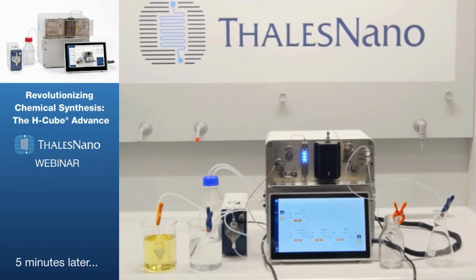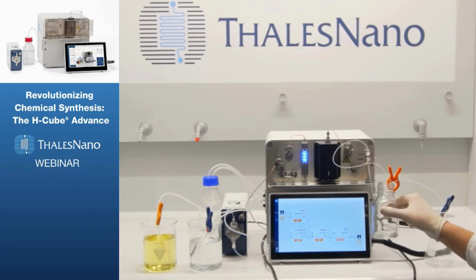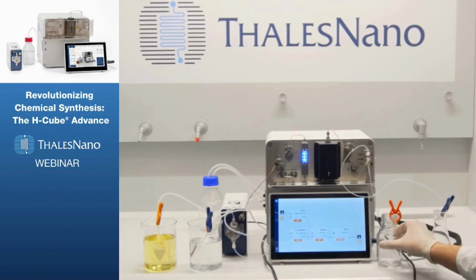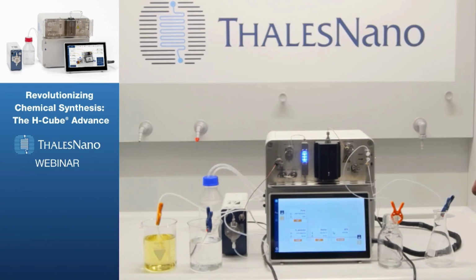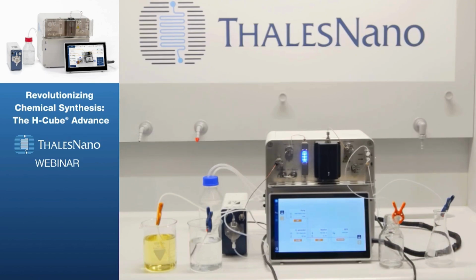Now I have been collecting the product sample for 5 minutes, and you can see in the product collection flask that we have a nice and colorless liquid, which is proof that the nitro group reduction has happened quantitatively, because the material has lost its yellow color that's characteristic to the nitro compounds, and we have formed the amine, which is a colorless material. So I've been doing this for about 5 or 10 minutes, collecting approximately 5-10 milliliter sample.